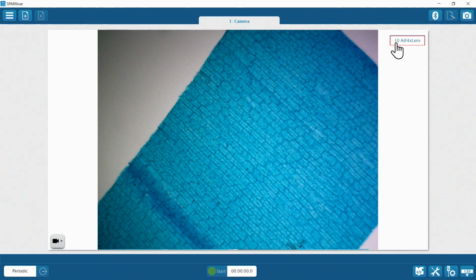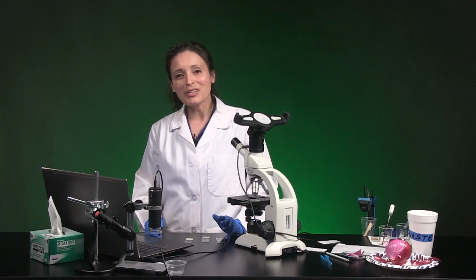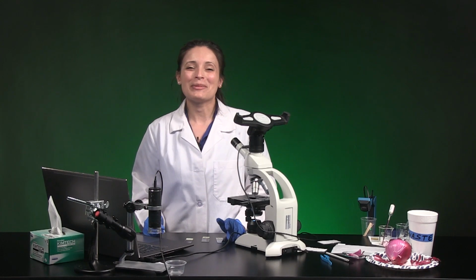Right now, image number 10 is slide A with the 4x objective lens. When I click the legend, I can scroll down and choose the 10x or 40x versions of slide A. Then slide B at the 3 objective lens powers, and slide C with the 3 lens powers. Fill out Table 1 as you go, then answer the questions at the end of the lab. Good luck!